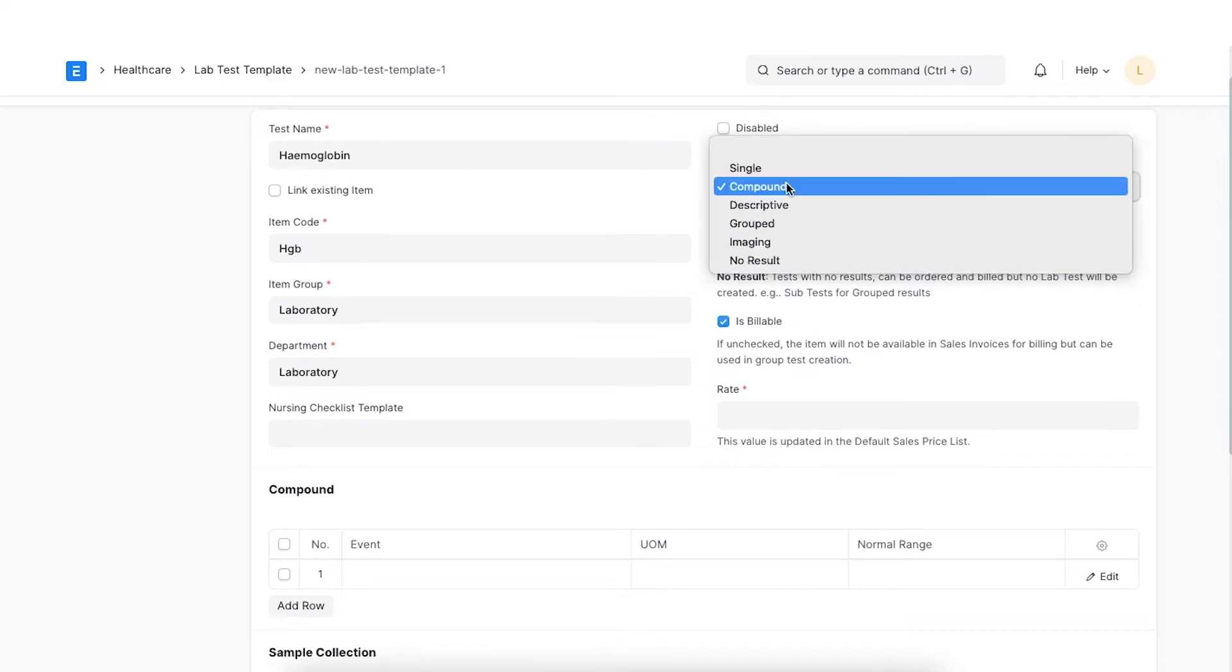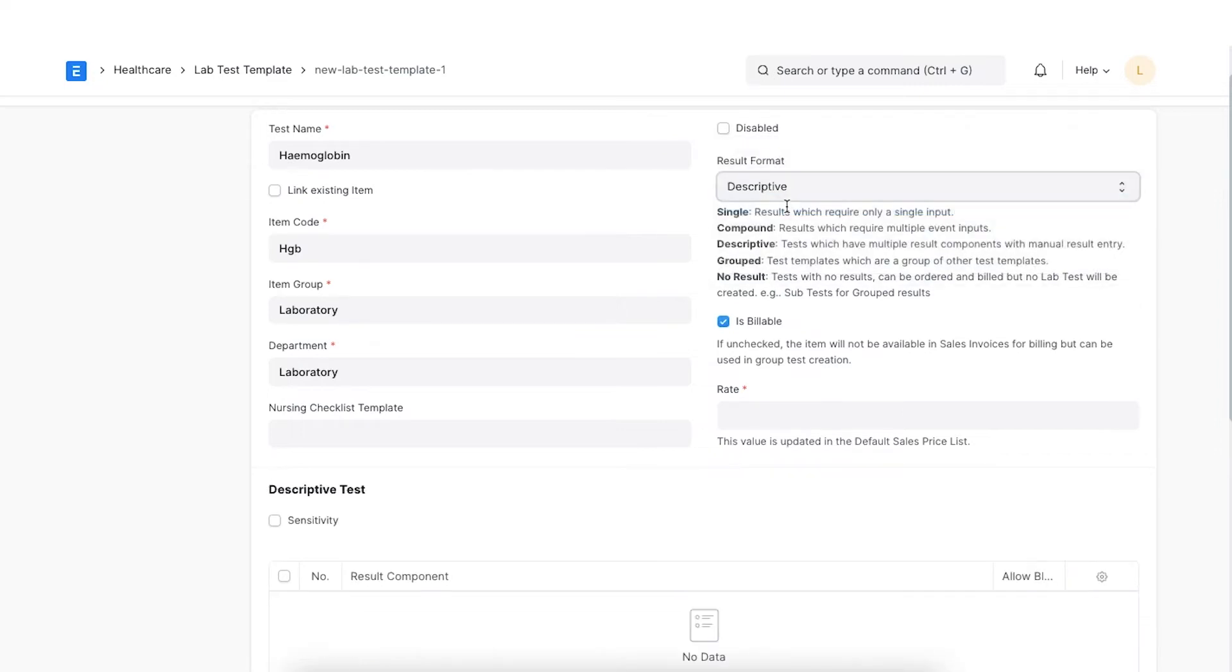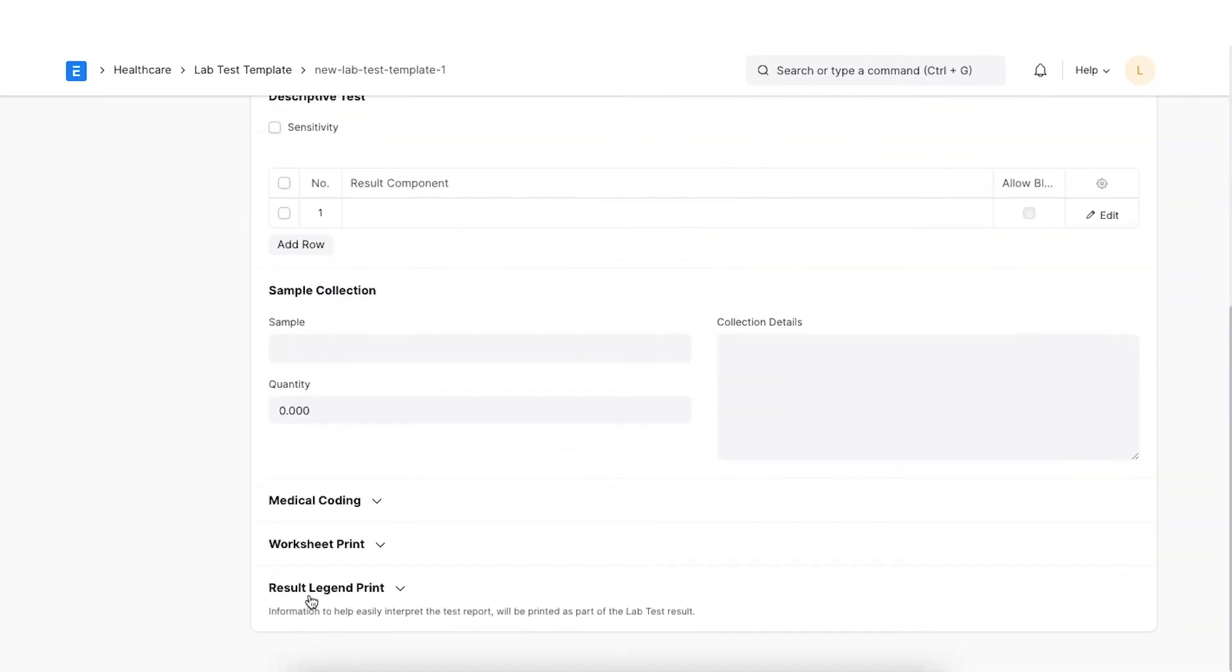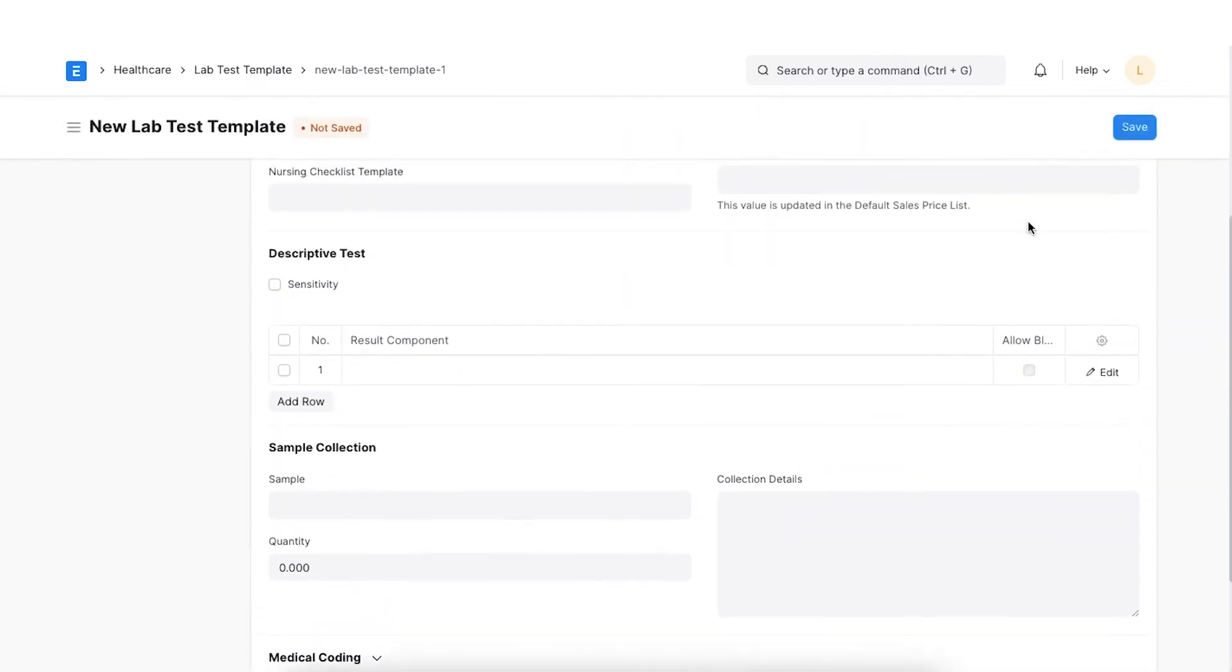Descriptive. These types of tests are used for testing multiple result components. You can also configure the testing the sensitivity of the sample for various antibiotics by enabling the sensitivity option in the template. You can use the allow blank option to allow keeping result entries blank for certain components.